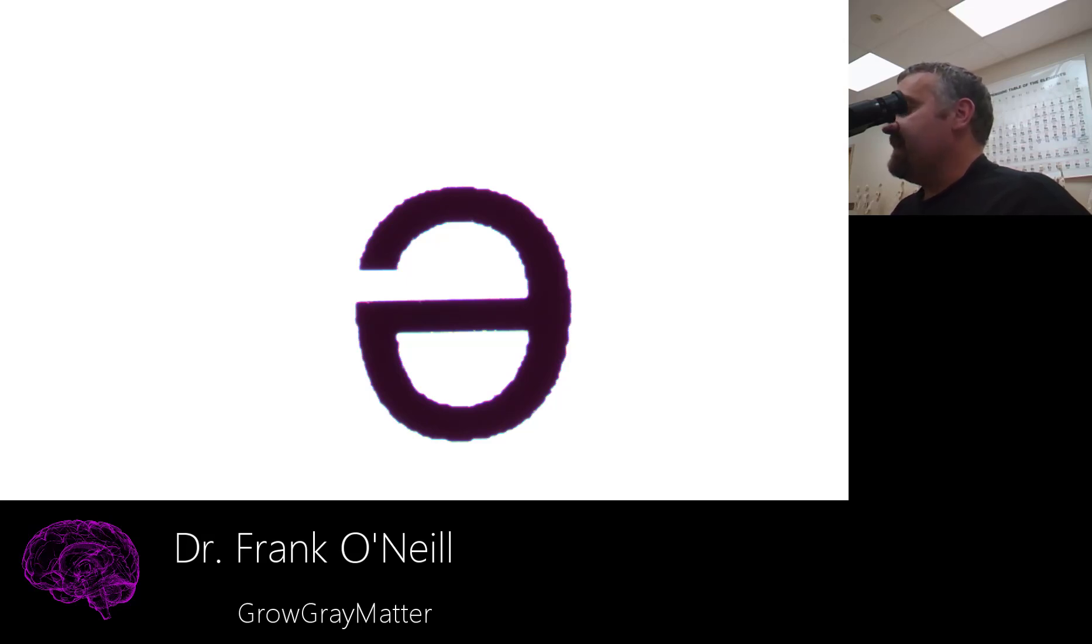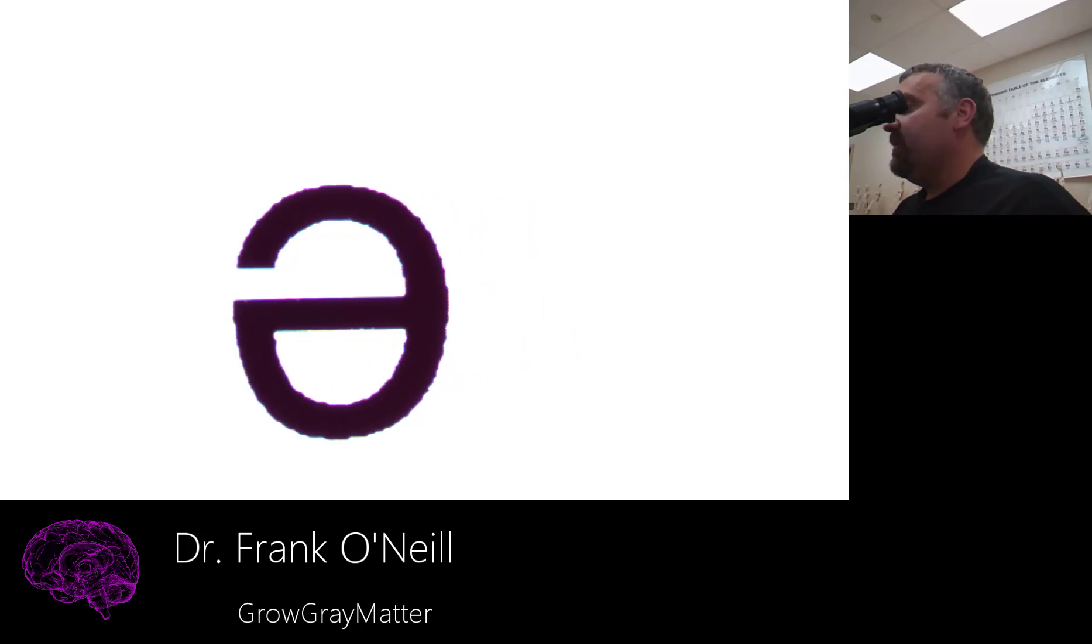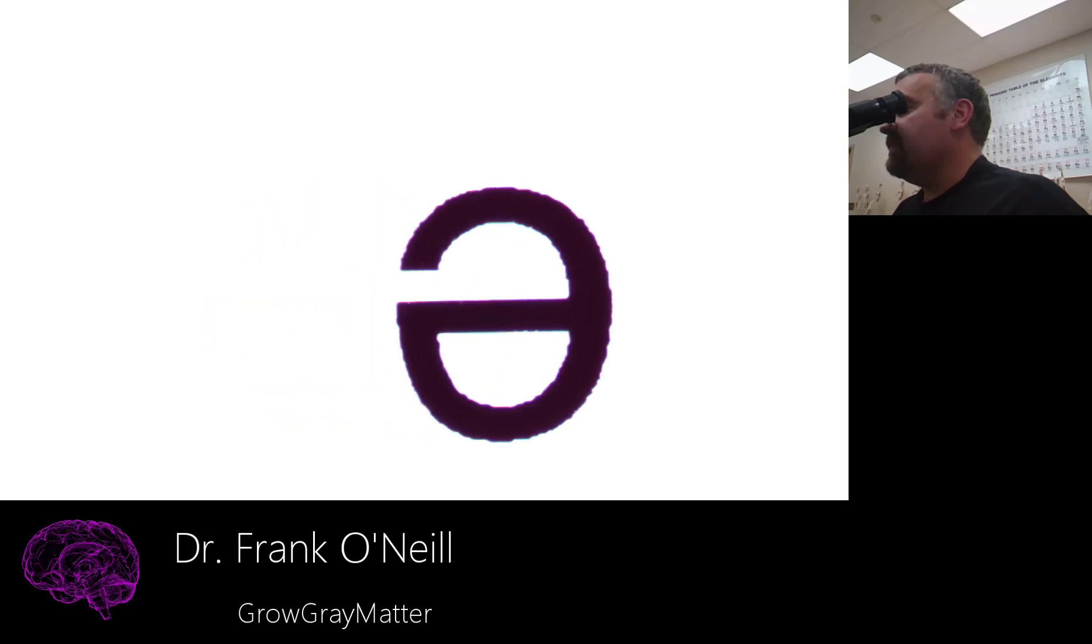So just like as I move the stage to the right here, you're seeing the letter E move to the left and vice versa. So everything is backwards. I'll go into the mechanics of that, but I just wanted you to see this as a reminder of why we use this activity.